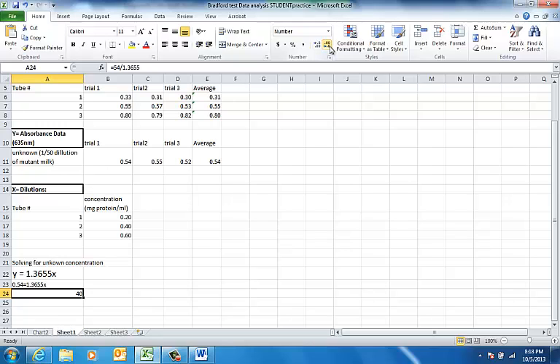Oh, that makes it fun because now we're going to have to deal with an awkward 0. So when you're putting it in your computer, I'm going to leave it with 4 sig figs, but remember it should be down to 2 sig figs in your actual lab report. So what does that mean? That would be your milligrams of protein per milliliter of protein.